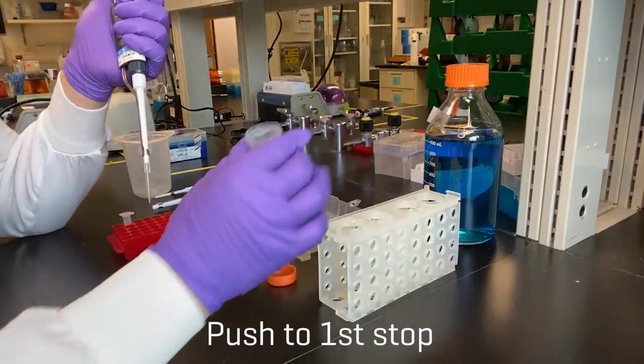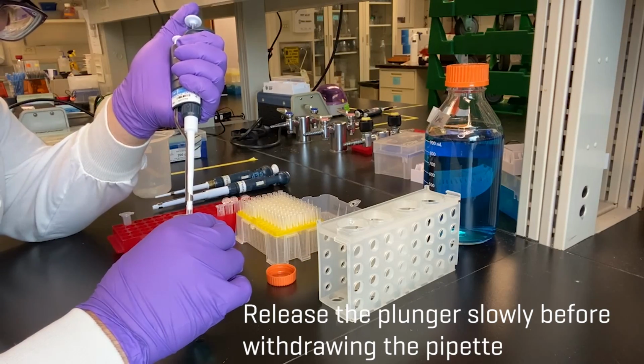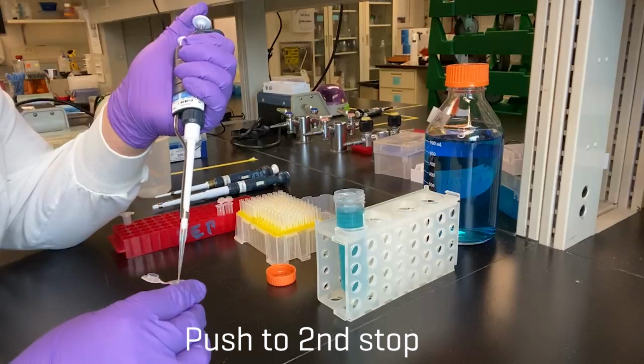Watch closely as I use the first stop to pull up the liquid. And go down to the second to expel it.